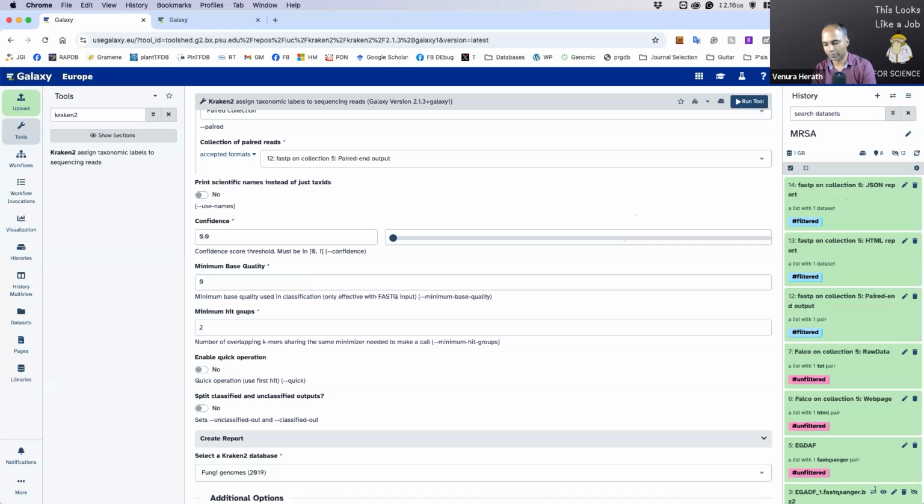Yeah, others, are you facing any issues? Excuse me, sir. Yeah. When we consider the GC mean changes, what is the minimum change when we consider it a significant change?